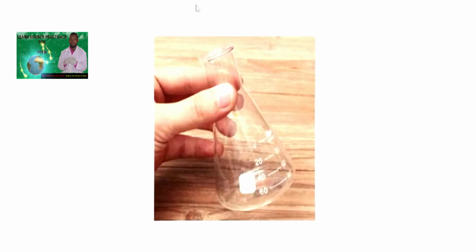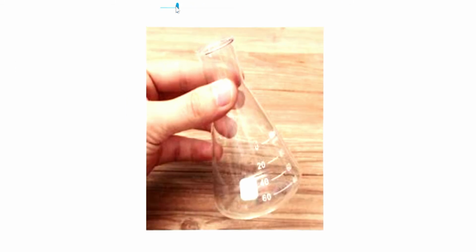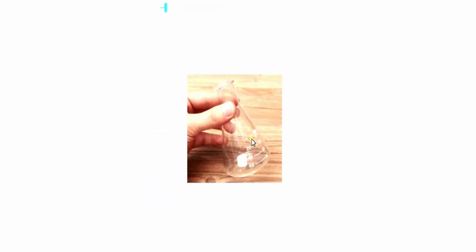Another apparatus is the white tile, to make sure you observe the color clearly, to improve the visibility of the color. That is a person or expert performing titration. That is our setup. We have the retort stand, the conical flask with the solution, and the white tile. That is our experiment preview, and a person performing titration. We have a full set.